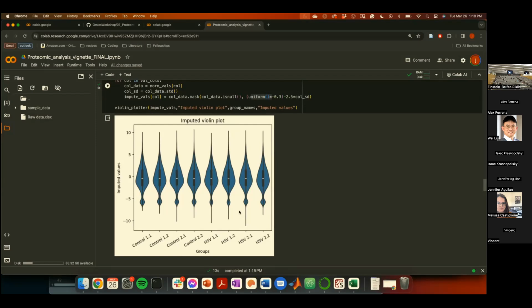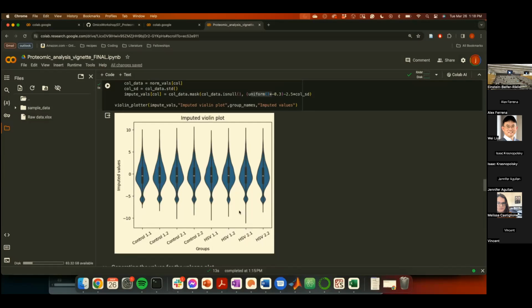When you have 3 replicates or 4 replicates, if you're using a non-parametric test, you lose all the power in the statistical analysis. If you think about it, if you have only 3 replicates, you have only a very limited combination of rankings, like 1, 2, 3, 4, 5, 6, or 1, 2, 5, 3, 5, 6. So it becomes very limited, right? If you use a non-parametric test, the equivalent being Mann-Whitney, for example, it's not going to work with 3 replicates. So we do a t-test assuming that our 3 or 4 replicates have a normal distribution.